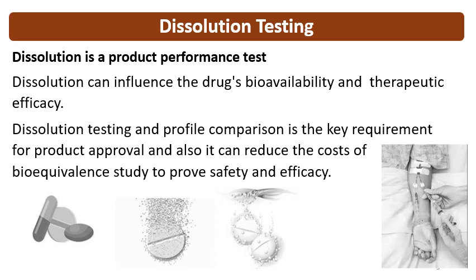You might know about BCS based biowaivers and biowaivers for the lower strengths. If you perform the bioequivalence study with the reference product on the higher strength, or the strength which is critical for bioequivalence, then the other strengths can get a biowaiver, and that biowaiver is based on dissolution similarity. For getting the biowaiver, and for getting the product approved by the regulatory bodies, dissolution similarity is required to be established.